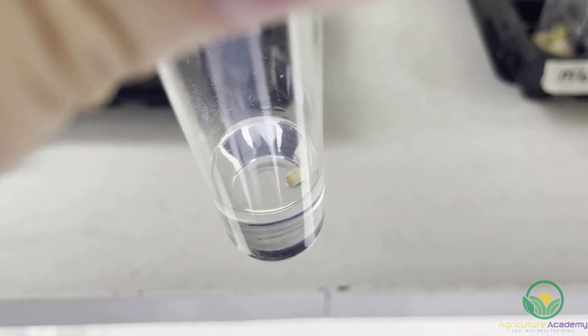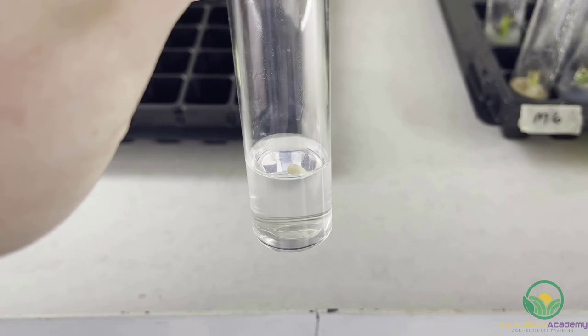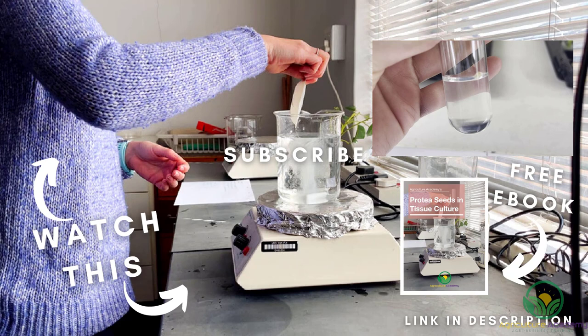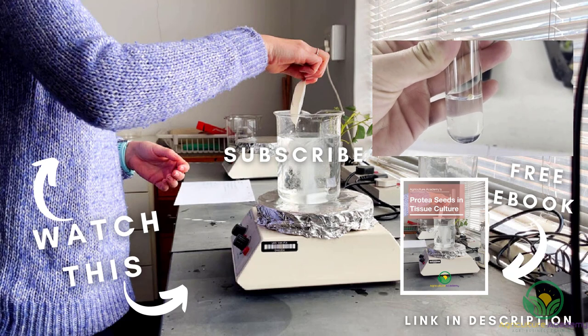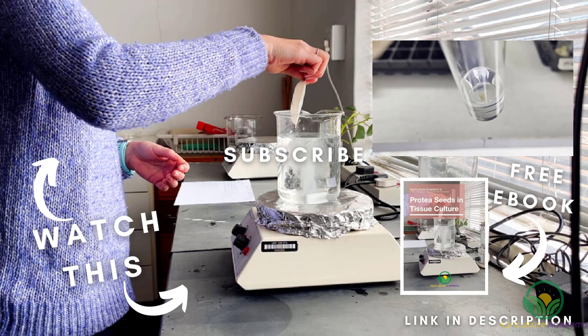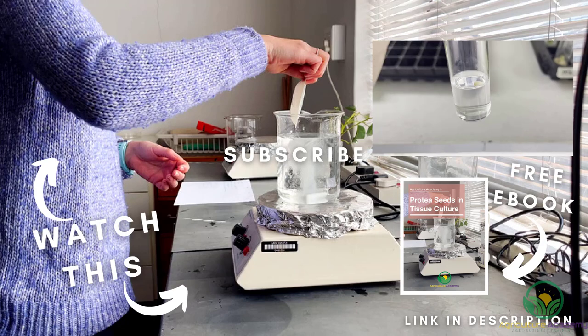The tubes are then sealed and placed into the growth chambers. These chambers are separate rooms that are heated and illuminated to meet the specific needs of the plants. In this case, the room temperature was 25 degrees Celsius and the lights were on for 12 hours a day. That brings us to the end of this video detailing the first stage in the process of tissue culturing protea seeds. In a follow-up video, we will show you how the seeds germinate, after which they can be dissected into micro cuttings and multiplied further.